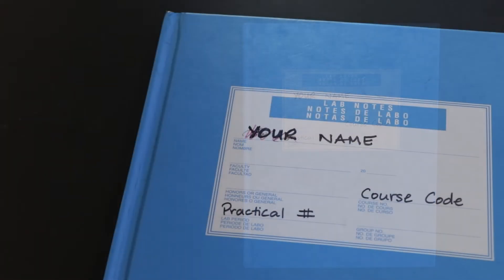This is a quick overview on how to keep a scientific notebook. The notebook is supposed to be the what, how, and why of the work you are doing. It must be reproducible, otherwise it is of no use.